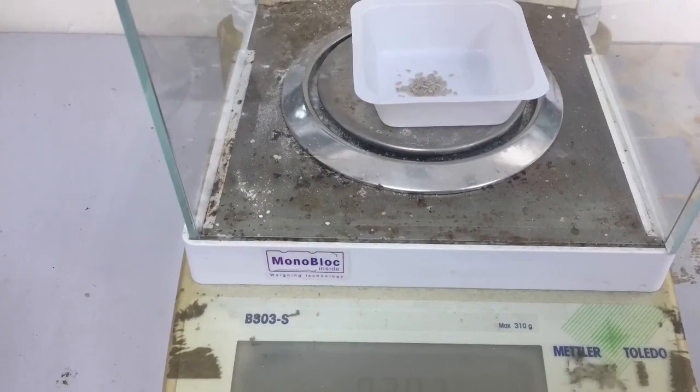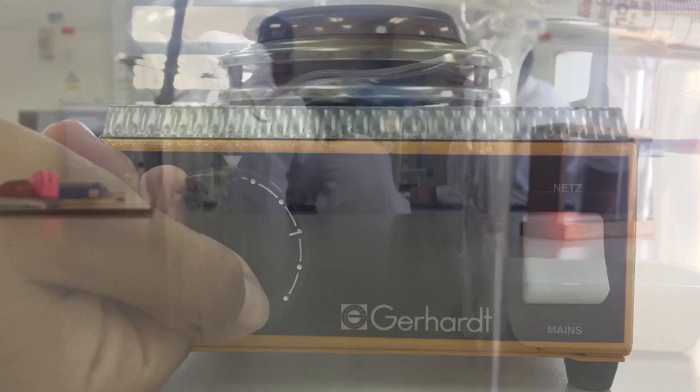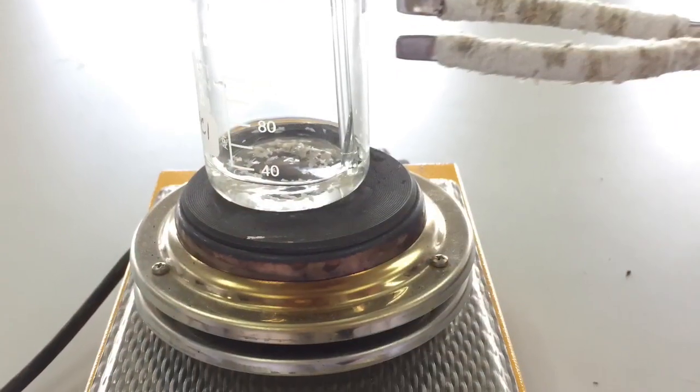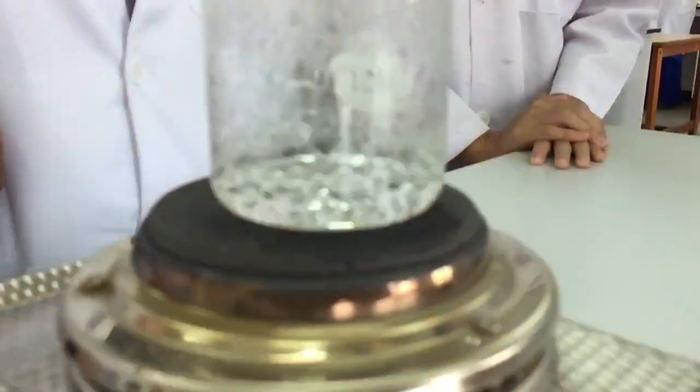Then 0.3 gram of acetanilide was weighed and put into a beaker. After that, 20 cm cube of distilled water was added and heated until boiled by using the hot plate. If not dissolved, distilled water was added little by little until all the acetanilide is dissolved.